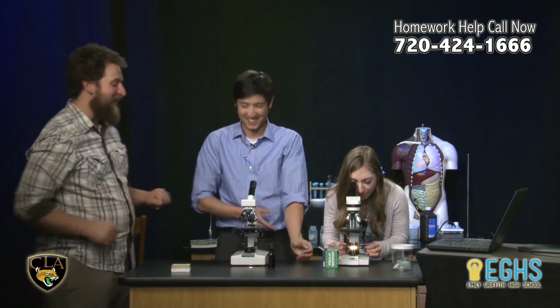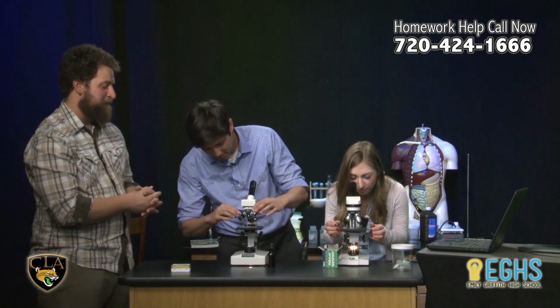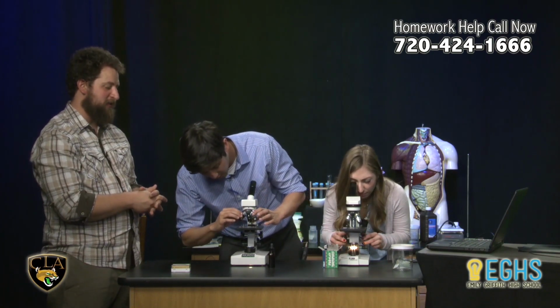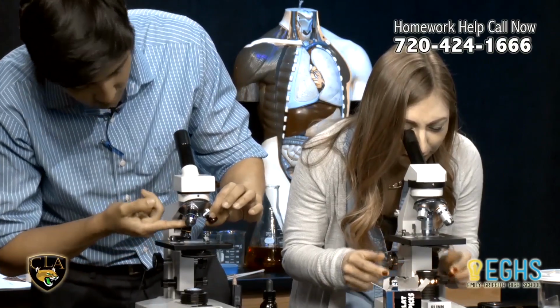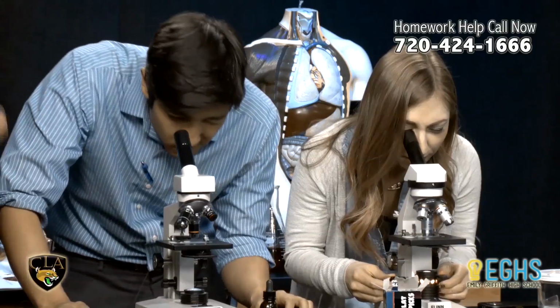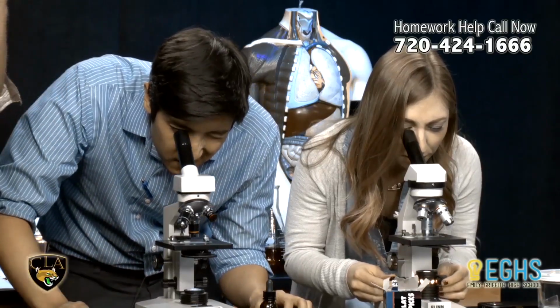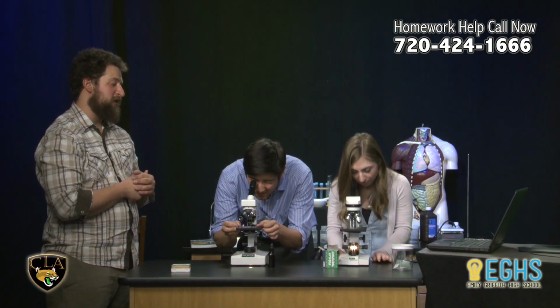Good job. So Nate, what I'll have you do now is bump up to the 100 times power. So we're just going to turn this a little bit, rotating it. You're rotating it clockwise, I guess. This way, right? I lost it. Because this is the 400 power. There we go. That's exactly right. We just want to bump up one power at a time, just to make sure we see what we're seeing, and move the part of the specimen we want to see to the center. Now it's a little off the needle, so I want to move it a bit more. Yes, exactly. Right. Now just adjust your slide gently.